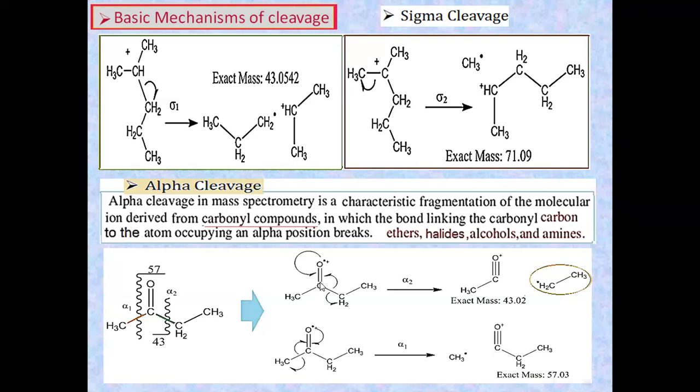Like here, look, that's the active group. That's the first carbon atom bonded to the active group. So this carbon is an alpha carbon, and also this carbon is an alpha carbon. So from alpha cleavage, look, the alpha carbon will not be within the species carrying the positive charge. This type of cation is an acylium ion. Acylium ion, we can write it as CH3, C positive, double bond oxygen. And of course, we are going to have resonance by the lone pair of electrons of oxygen, which leads to the formation of this stable structure of the acylium ion.